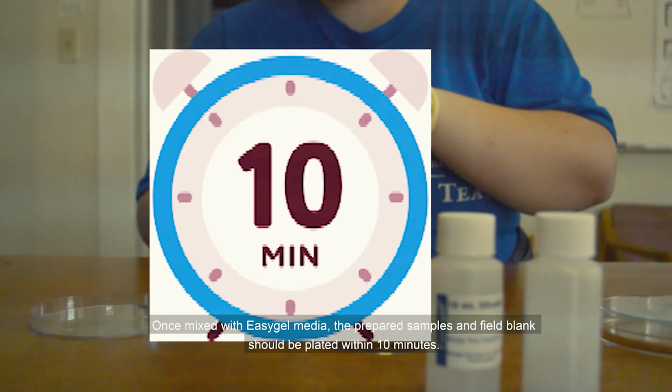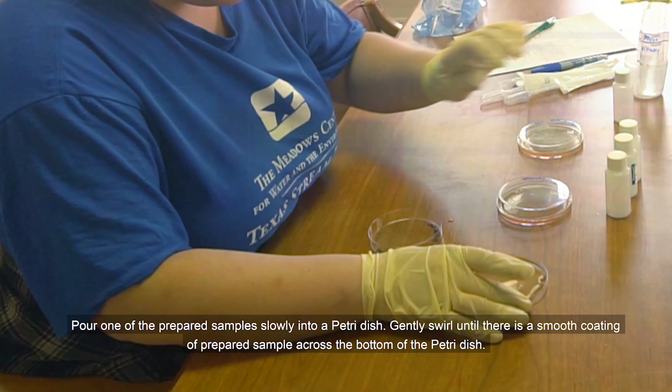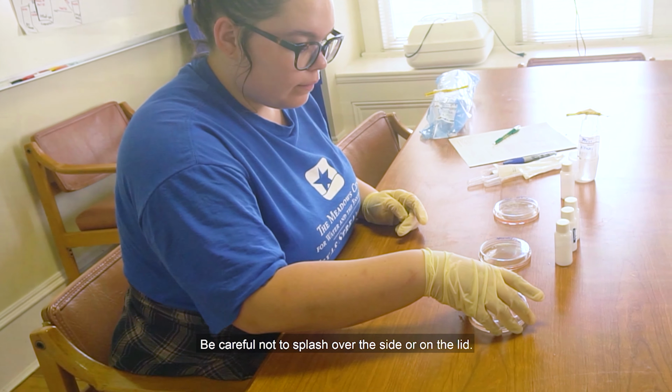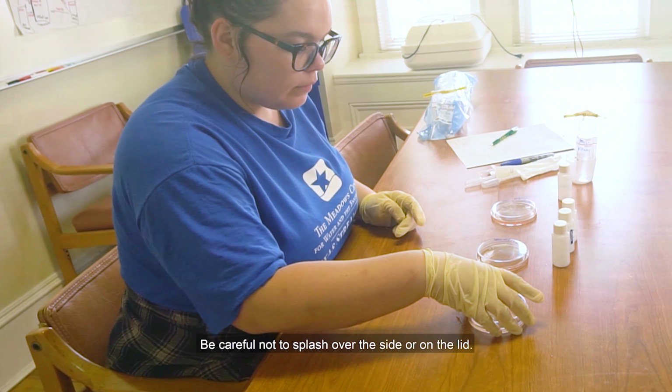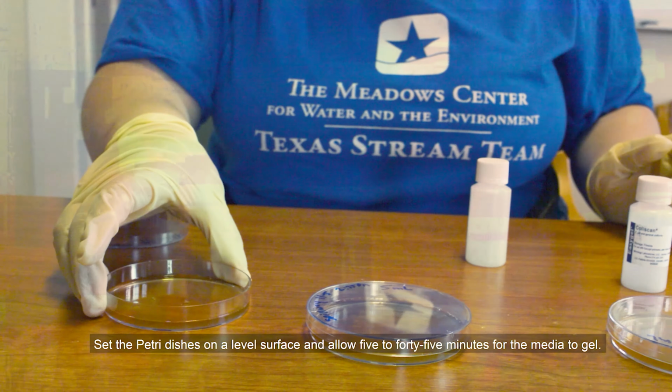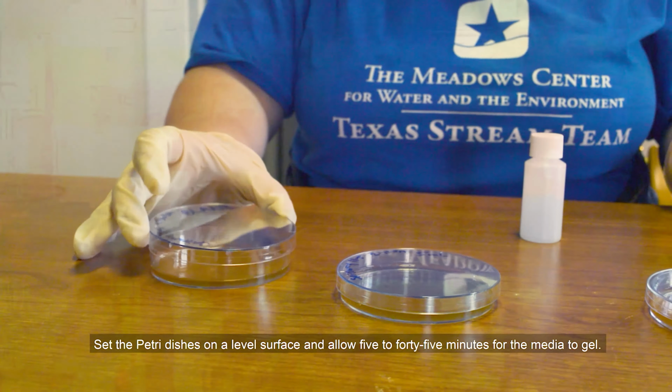Pour one of the prepared samples slowly into the petri dish. Gently swirl until there is a smooth coating of prepared samples across the bottom of the petri dish. Be careful not to splash over the side or on the lid. Repeat this step for your other samples and for your field blank onto new petri dishes. Set the petri dishes on a level surface and allow 5 to 45 minutes for the media to gel.